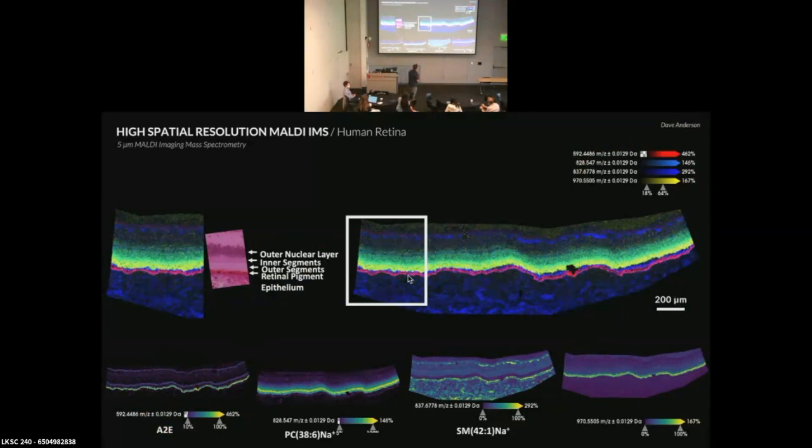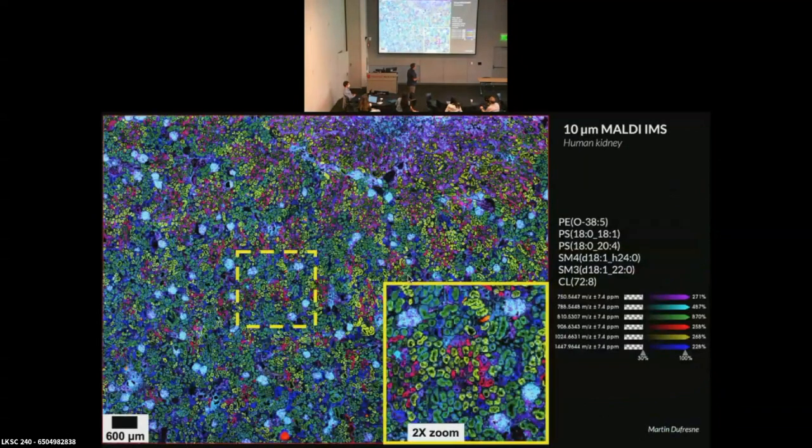Of course, we can do this for any tissue type. So this is an example of some of our data from the human kidney. And everything you'll see after this is associated with our kidney studies. And what you're looking at here, these are a little bit tricky to look at because these samples are so large. But the top right corner is the medulla. This is an overlay of these 6 molecules here, and their associated colors are listed in the same order below. And so we have the medulla, and the primary portion of this image is all the cortex.